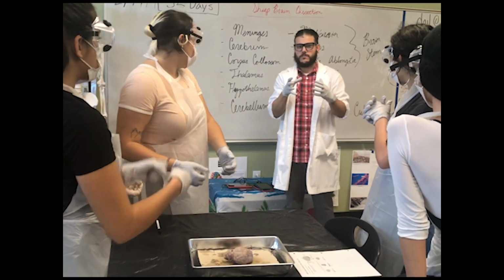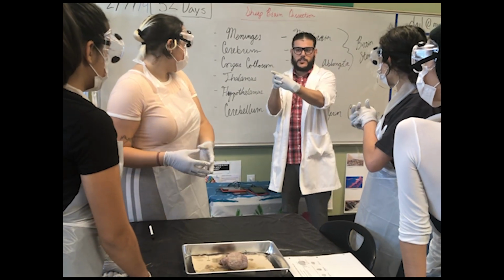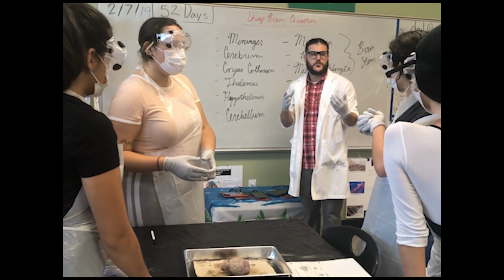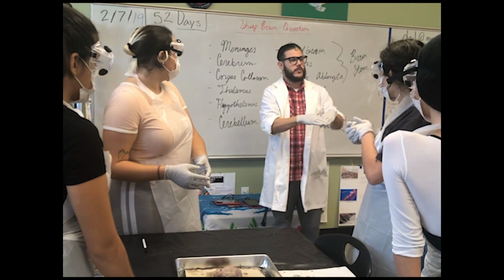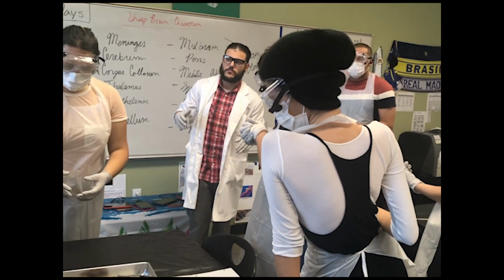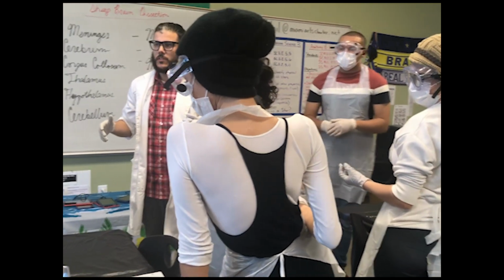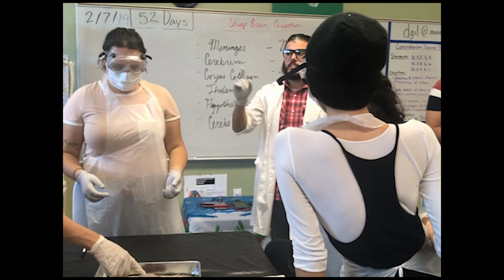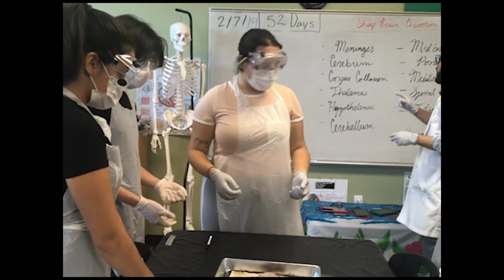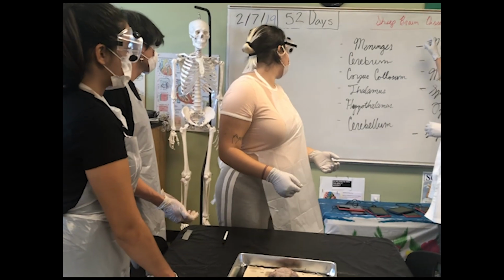What you guys just saw, this saran wrap of the brain, in theory, what do you think it does? Protection, for sure. It keeps liquids in. That's huge. Almost like a hydration layer, or like the top of a leaf that has a cuticle layer. Only exclusive blood cells go in there, not all of them, just selectively permeable. Very good. That saran wrap is the meninges, ladies and gentlemen. We're gonna cross that off.